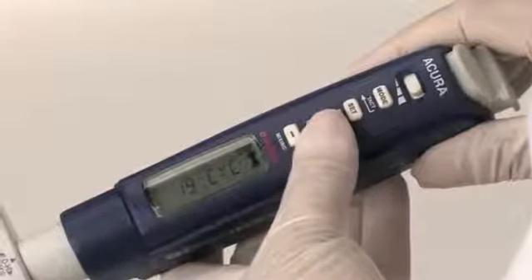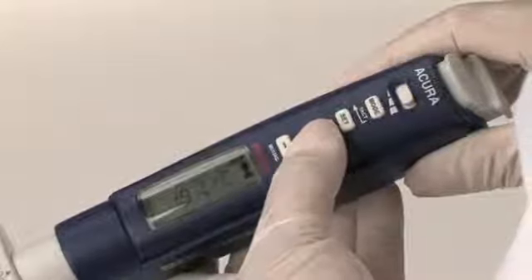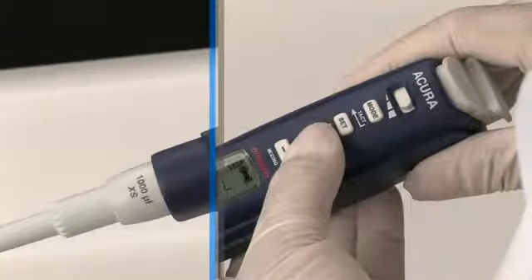The cycle counter displays the number of cycles performed since the counter unit was last reset to zero. Consecutive aspiration and dispensing are counted as one cycle. It enables maintenance and calibration tracking, or may be used for any other purpose.